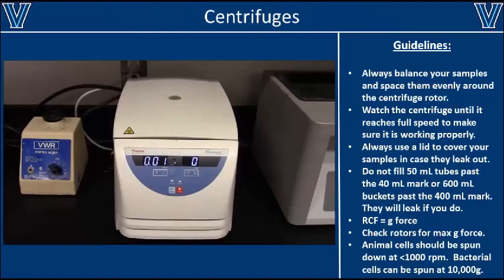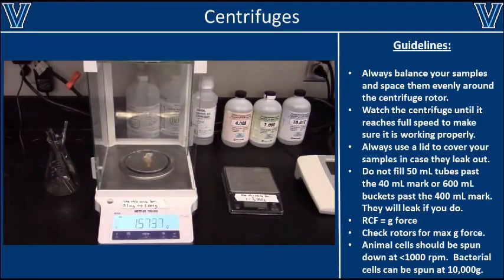Centrifuges are also commonly found in most labs. They're used to separate particles of different densities by spinning them rapidly to generate a high G-force. Since most centrifuges do operate at rather high speeds, it is important that you know how to properly use them to avoid damaging the centrifuge or harming yourself.